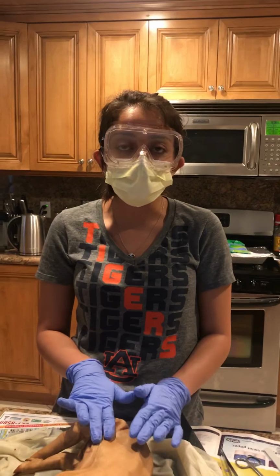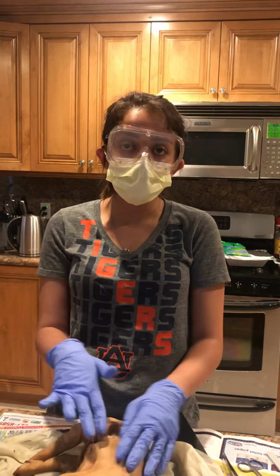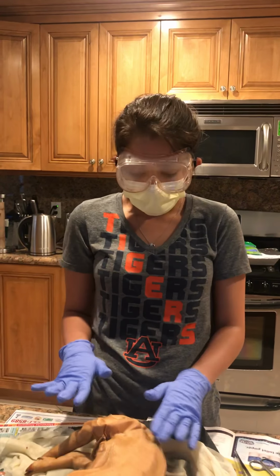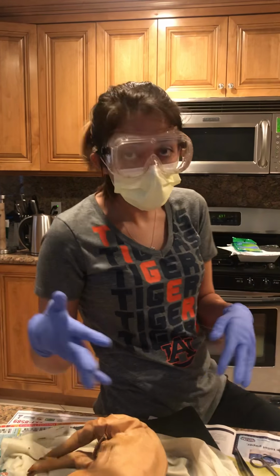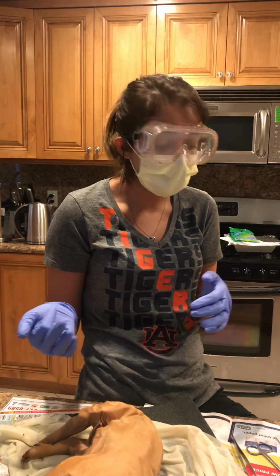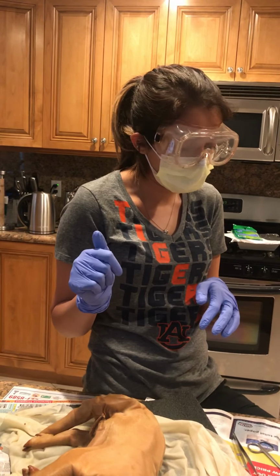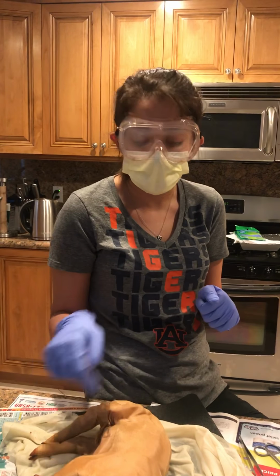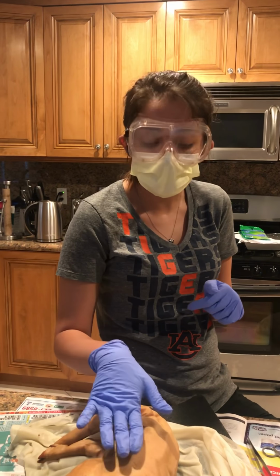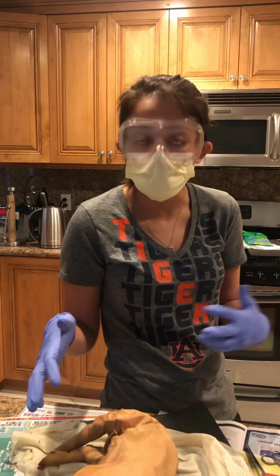Today's date is September 22nd, 2018, and today I'll be going over how to dissect a fetal pig and also go over its cardiovascular system. There are a few structures specifically that I'm going to go over. We have the external jugular vein and the internal jugular vein. I also have the left and right subclavian veins. Then I have the brachiocephalic trunk and the superior vena cava. And the cephalic vein, and 4 other structures that I'm going to choose just to show you guys where they're located.